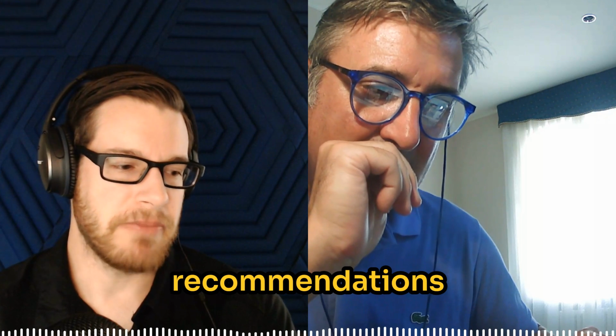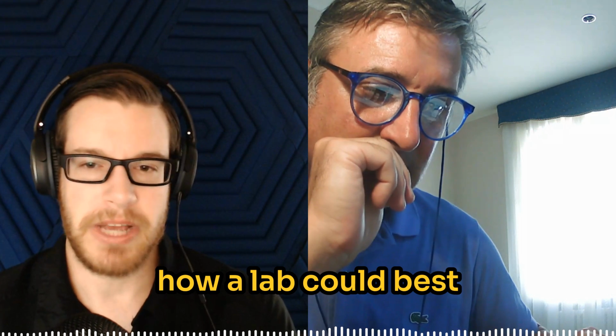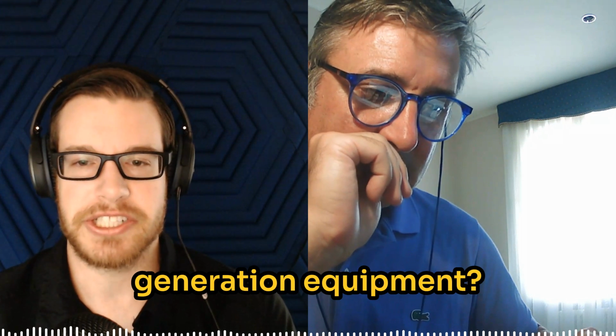What are the best recommendations you have in terms of how a lab could best maintain their nitrogen generation equipment?